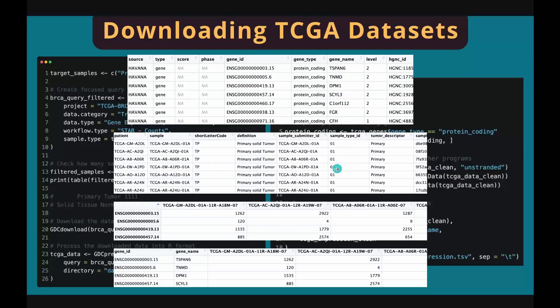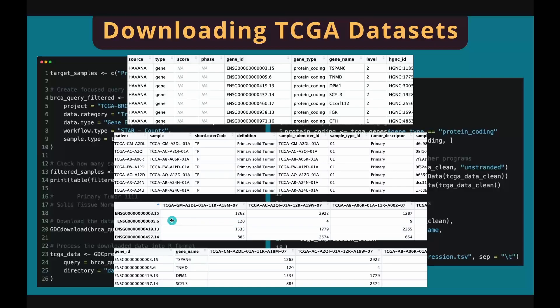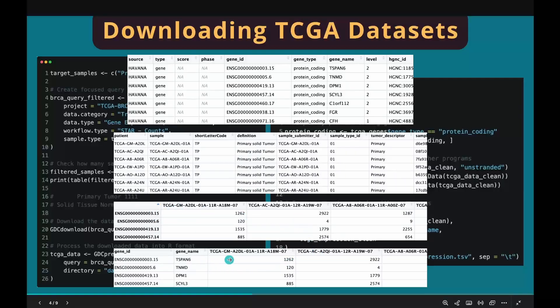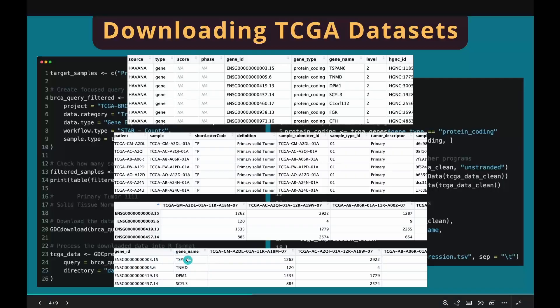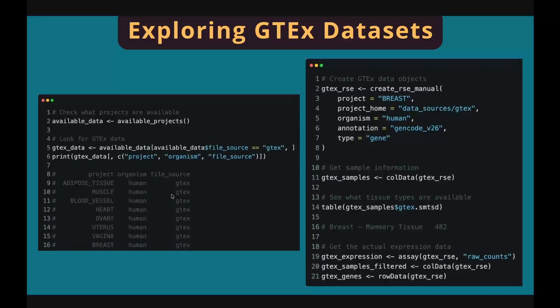And this is the sample information table extracted by the colData function. This is the gene expression matrix extracted by the assay function, and you can see there's no gene information columns in the table. And this is the final gene expression table we made by adding back the gene information table.